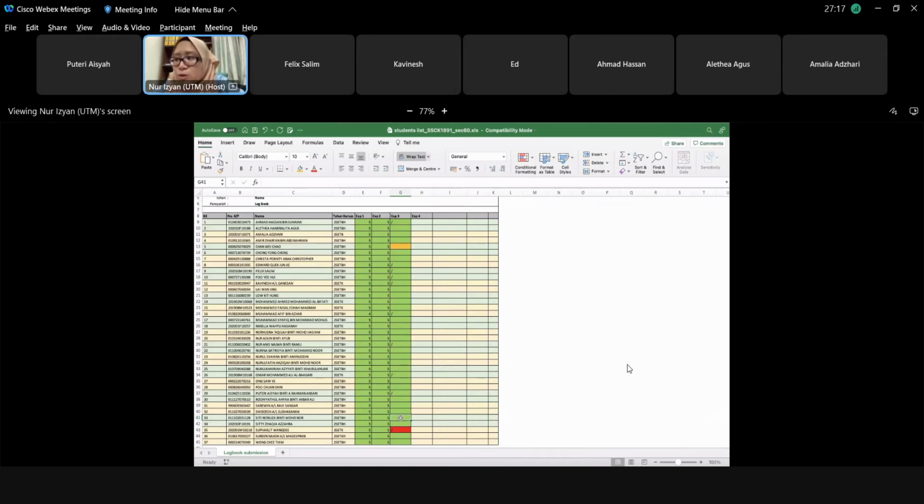The concentration of the stock solution prepared just now? 1,000. The unit? Mol. No. The unit for the concentration. ppm. Okay, thank you. Thank you, Norliza.